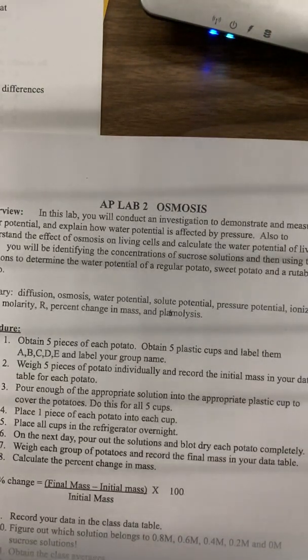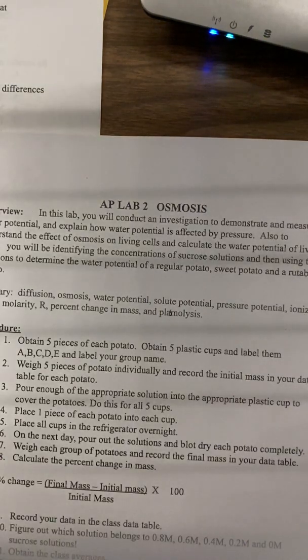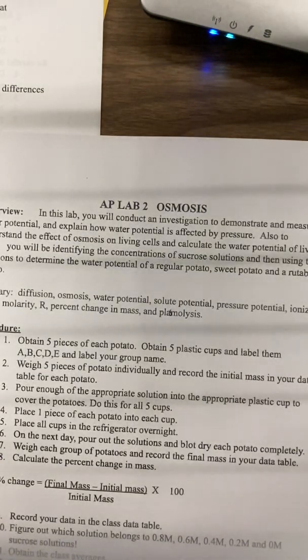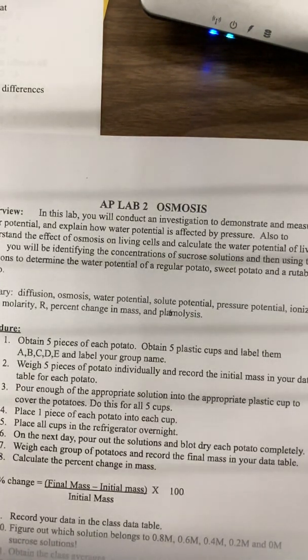Okay, for your drawings, your setup, you want to look at your procedure and how you're going to set this up. Looking at the procedure, it says to obtain 5 pieces of each potato. So you're going to have 5 rutabaga, 5 sweet potato, and 5 regular pieces of potato. You're going to have 5 cups, and you're going to label those cups A, B, C, D, E, and those A, B, C, D, E refer to the different colored solutions that you'll have to put in on top of those potatoes. They'll be 0.2, 0.4, 0.6, 0.8, and a 0 molar solution, and there'll be different colors of food coloring. You will not know which one's which.